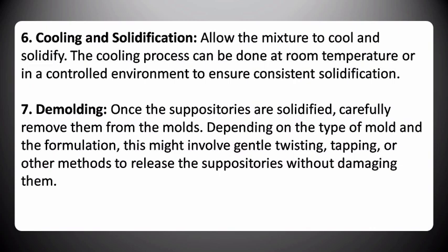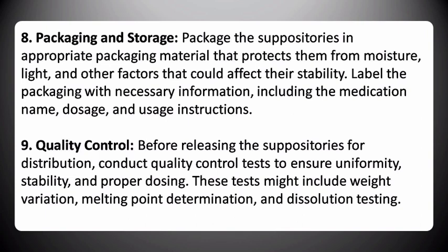Seventh, demolding. Once the suppositories are solidified, carefully remove them from the molds. Depending on the type of mold and the formulation, this might involve gentle twisting, tapping, or other methods to release the suppositories without damaging them. Eighth, packaging and storage. Package the suppositories in appropriate packaging material that protects them from moisture, light, and other factors that could affect their stability. Label the packaging with necessary information, including the medication name, dosage, and usage instructions.